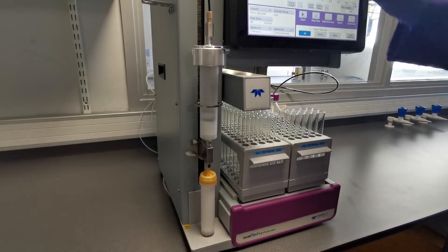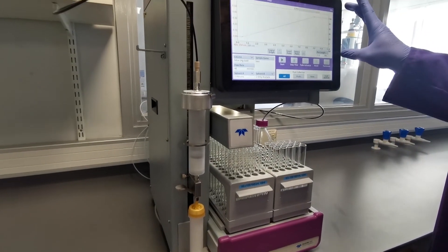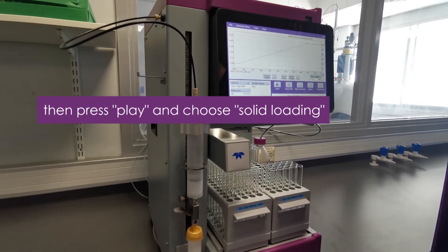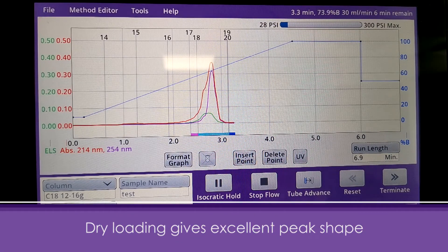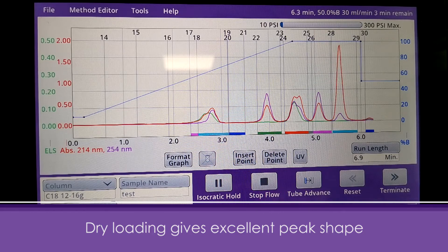We're then ready to set our gradient up on the system in order to run our sample. Thank you very much for attending this video on how to run a solid load sample on the next-gen 300+.